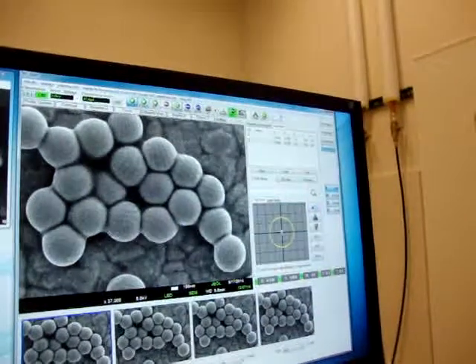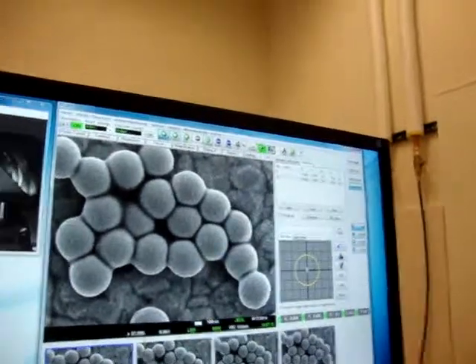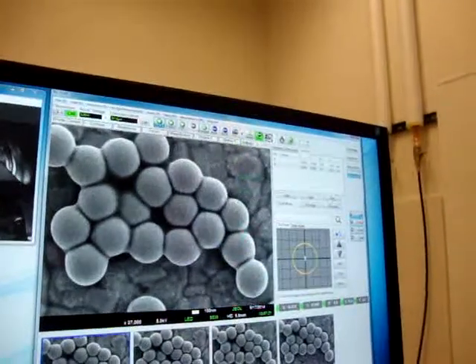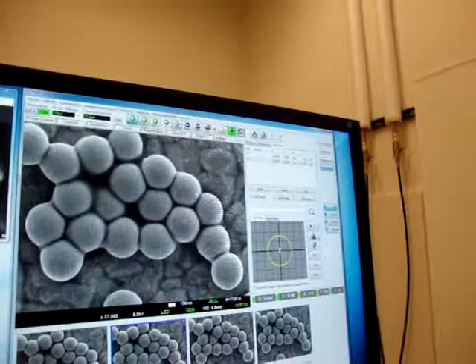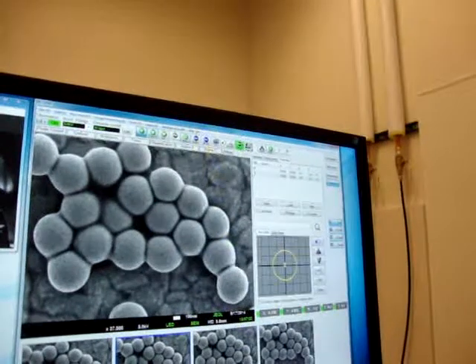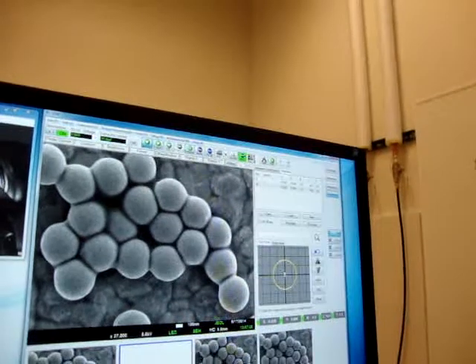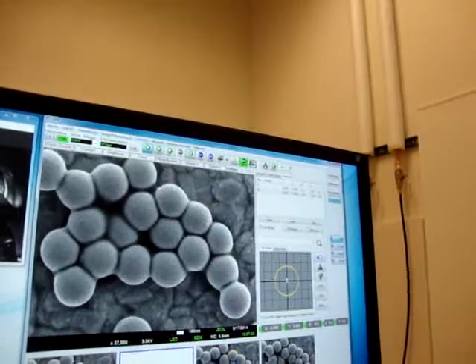So, what is this? It has to do with how they process the imaging. Okay. So over here I can have a different processing like BEDT. Can I click that? You can click anything. The question is, what do you get at the end of the day, right?